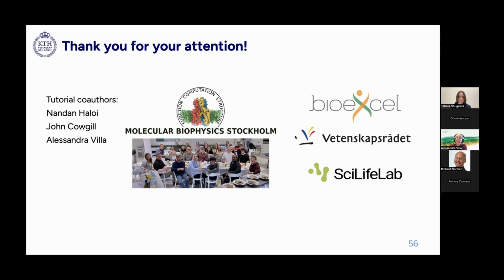Okay, thank you. And then I have a follow-up question: how to deal with noise and resolution when generating the density used for density similarity? Well, when we generate artificial density during the GROMACS run, of course, it is much less noisy than the reference density that we want to fit into.